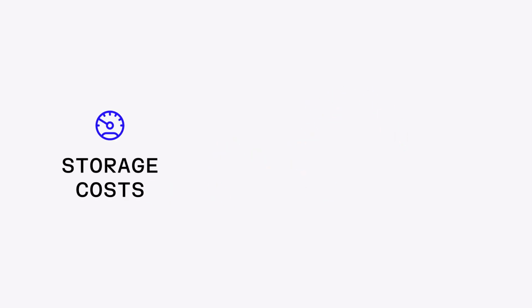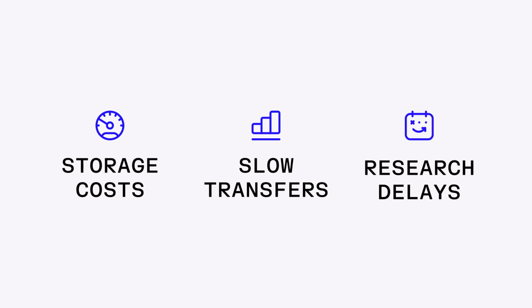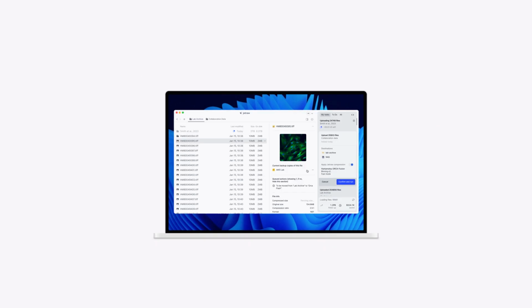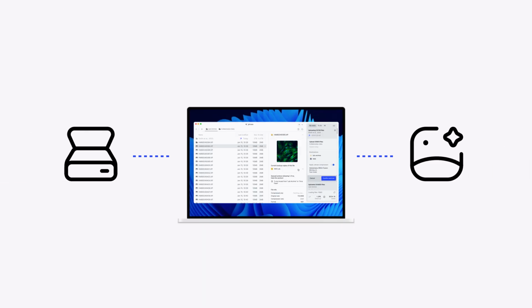As raw data volumes grow, storage fills more quickly and costs rise. Transfers slow down and research timelines are delayed. Jetraw tackles these bottlenecks as middleware between the microscope PC and your storage system. It accelerates data workflows from acquisition to analysis.